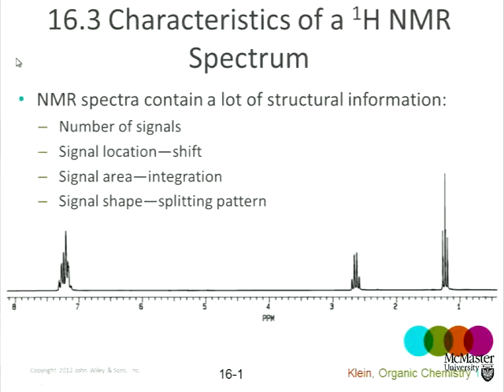And so the reason that we've left proton NMR to later on is the recognition that it's much more complicated than just counting 1, 2, 3. So, what can we get out of this? The number of signals, that's the 1, 2, 3 bit. Remember, in carbon NMR, the number of signals told us about the environment of the carbon nuclei, whether they were shielded or not, what functional groups were present at or around a particular carbon atom.